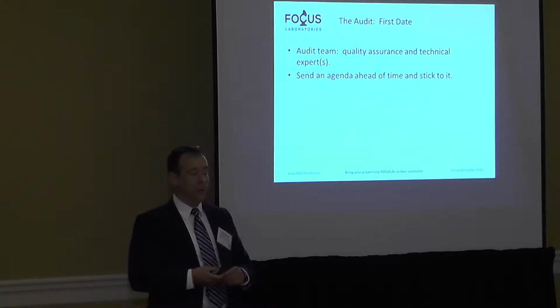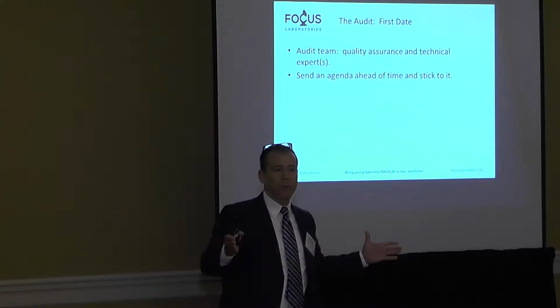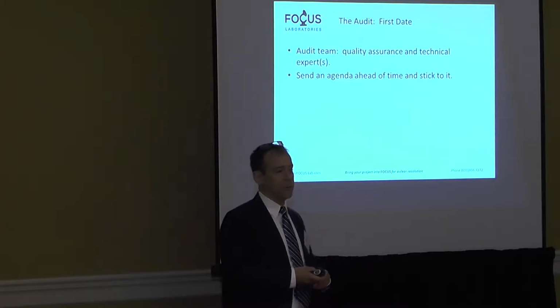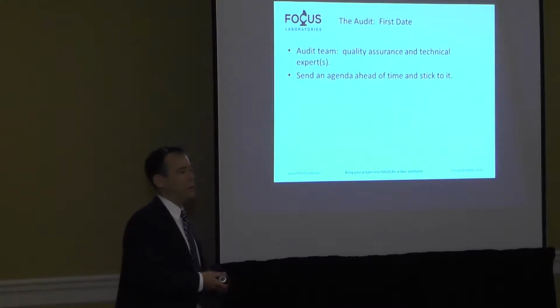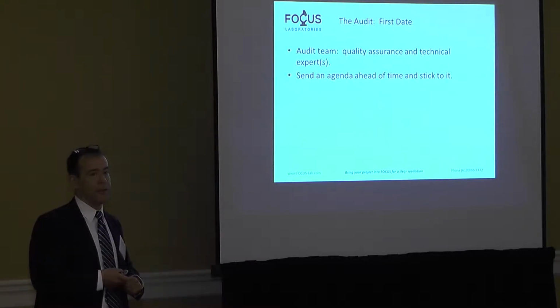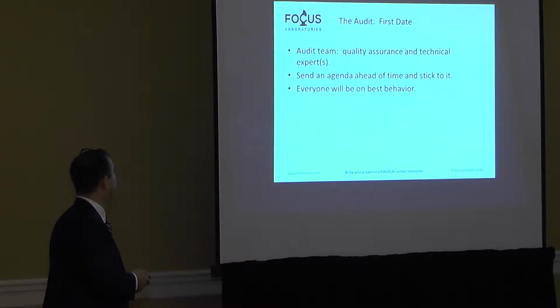I've seen labs, and I've been party to labs, that try to stretch the audit experience out where there's very little actual observation. You want to spend as much time in the laboratory as possible. You can look at paper, you can have a nice lunch, you can have a sales presentation, but it's in the lab that it happens, and that's where you really want to maximize the time. So ask for extended time in the lab.